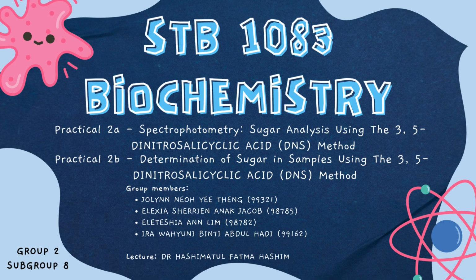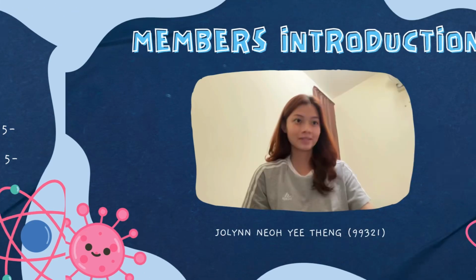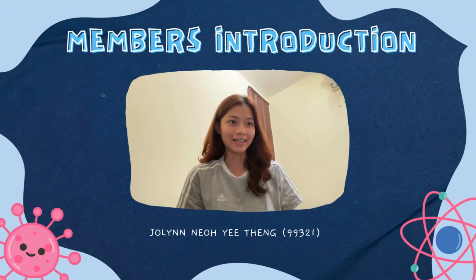This is our video for practical 2A, spectrophotometry sugar analysis using the 3,5-dinitrosalicylic acid (DNS) method, and practical 2B, determination of sugar in sample using the 3,5-dinitrosalicylic acid (DNS) method.